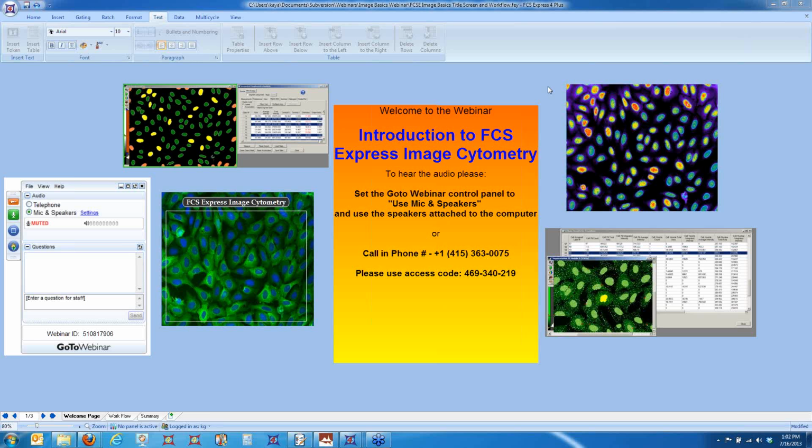In other words, they both involve taking multi-parametric data sets, be that multi-channel fluorescence data or multiple morphological features that you're collecting from your cells or other objects, and analyzing that data by plotting it in 1D plots like histograms or 2D dot plots or contour plots, and looking for statistically different changes among the different populations that you determine based on gates that you set subjectively.